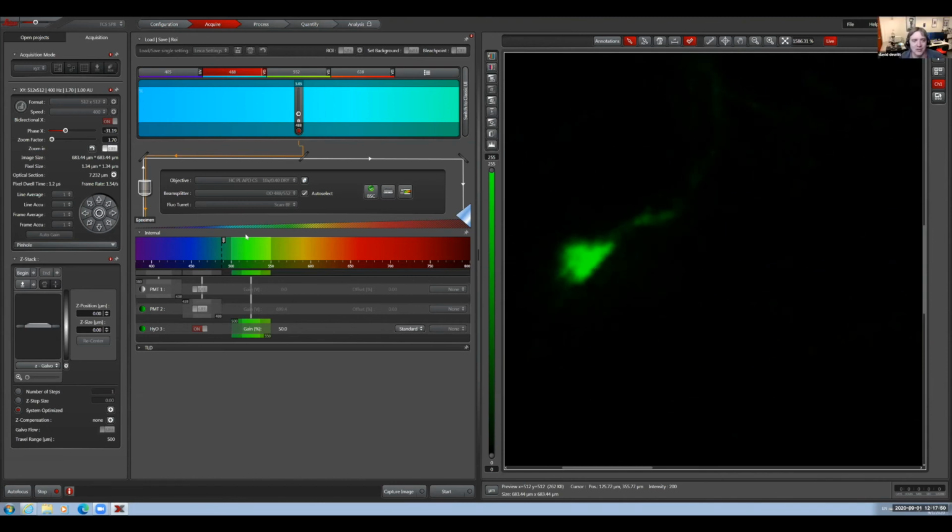If you see it, you can try to adjust the phase to make it perfect, or you can just turn bidirectional off and it will be completely gone. If bidirectional is not on, you don't have to worry about it at all. But if it is on, there's always the chance that you could get slight artifacts there. But it is basically a free doubling in your speed.